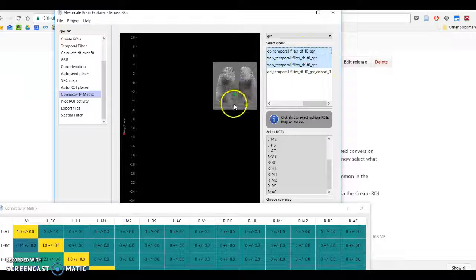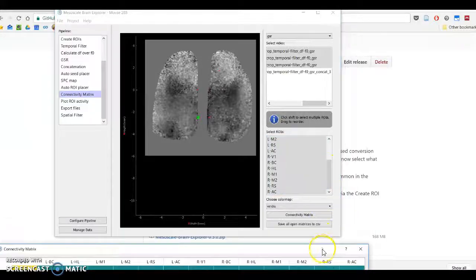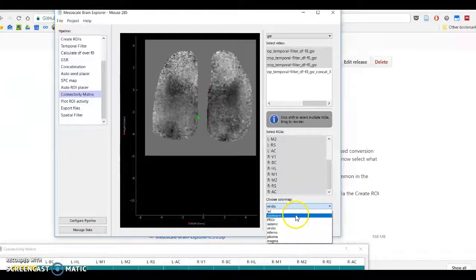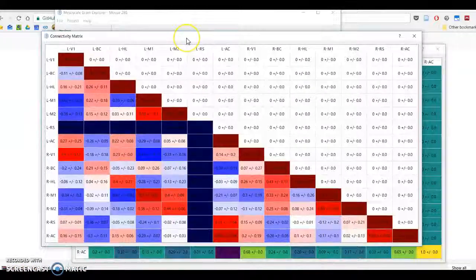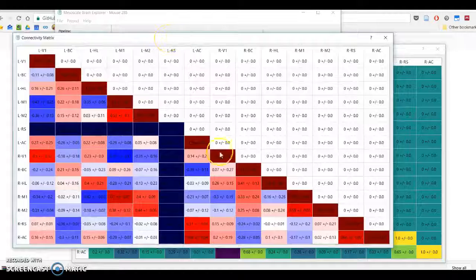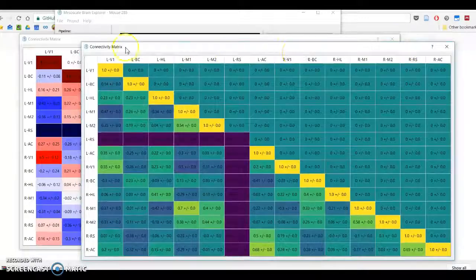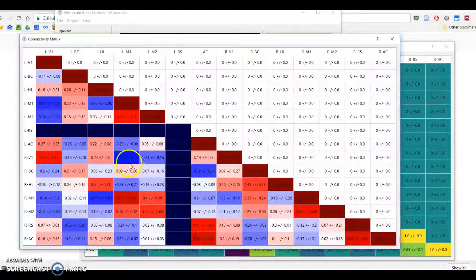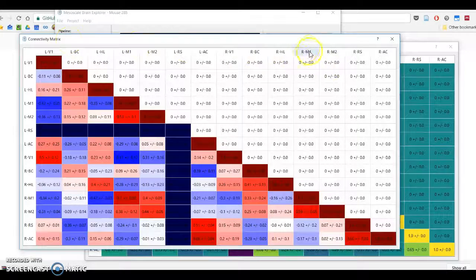So say I selected all of these at the same time, and now what I'm going to quickly do is head over to, let's pick seismic this time, and replot the connectivity matrix. Right, here's the output, and as you can clearly see, seismic is really well suited to clearly differentiating negative from positive correlation. And again, it's a diverging color map, unlike this one, which is sequential, but it is at least monotonically increasing perceptually from the center towards the blue or towards the red.